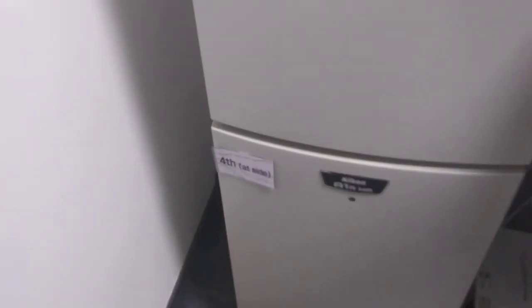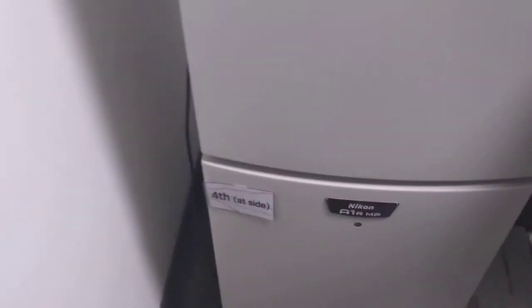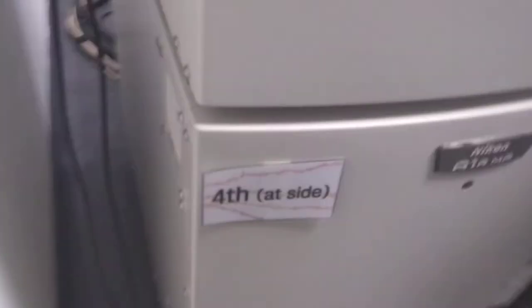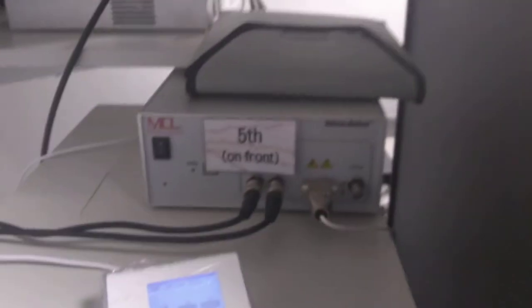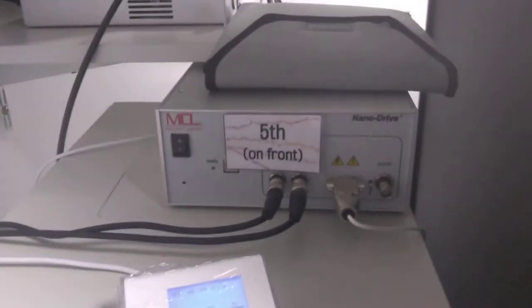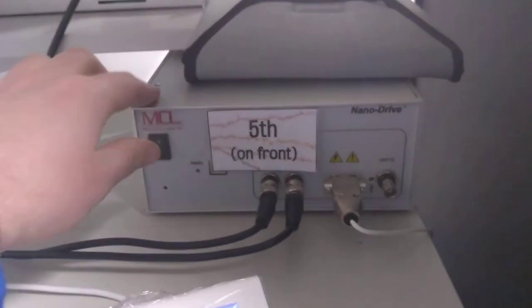Then, the fourth switch is a button on the side of the tower at the bottom. After this, you may turn on the piezo focusing device. This is optional, as you may not be using this.